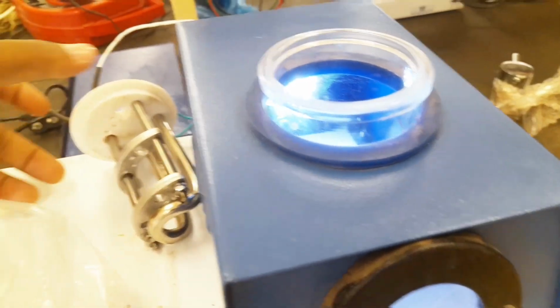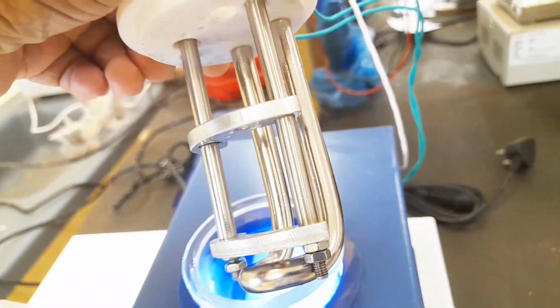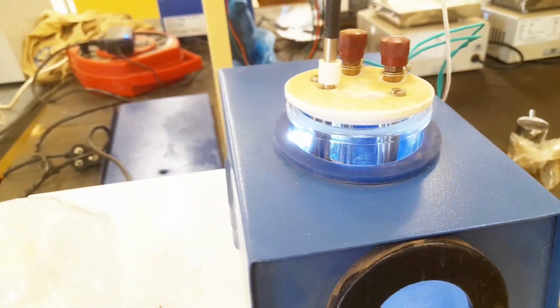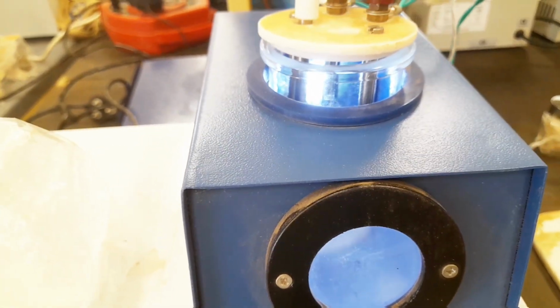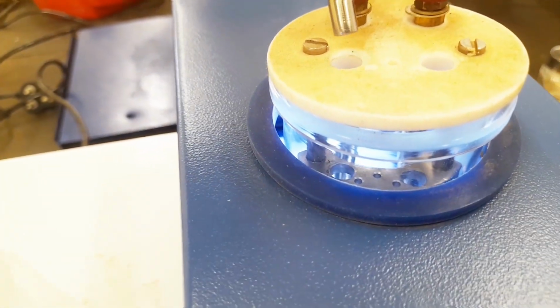Here you can see the regulator, and this is the heating coil, which is connected to the back part of the instrument. We keep the heating coil inside like this. When we start sampling, first we fill the glass beaker with the oil. Then we close it by arranging the stirrer inside. Then we can see this indicator, which gives the temperature difference.